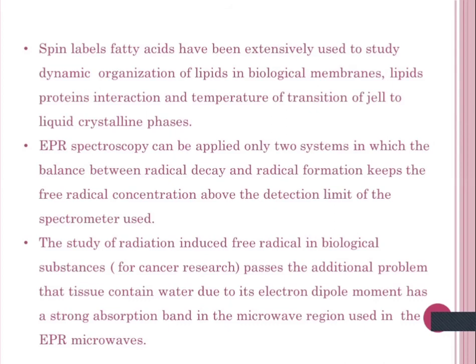The study of radiation induced free radicals in biological substances for cancer research poses the additional problem that each tissue contains water, which, due to its electric dipole moment, has a strong absorption band in the microwave region used in the electron paramagnetic resonance spectrometers.